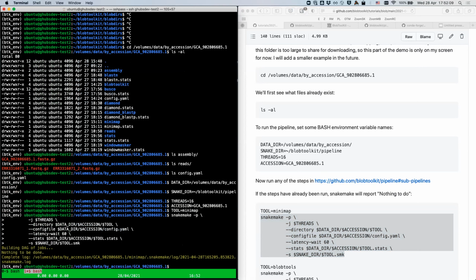And you can see this is redundant with what we've already done with the full Snakemake pipeline. With the old V1 pipeline, it's exactly the same steps. The difference is you get slightly different statistics, you get the breaking up into tens and things like that. So that's why you would do this separately, as opposed to what we did half an hour ago. What did we do half an hour ago?